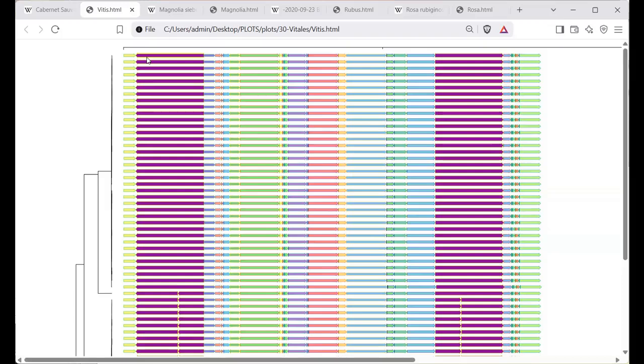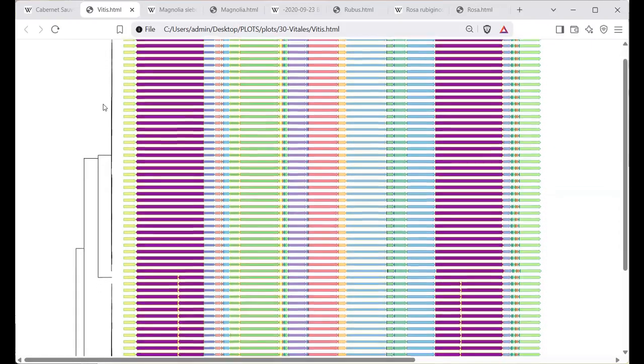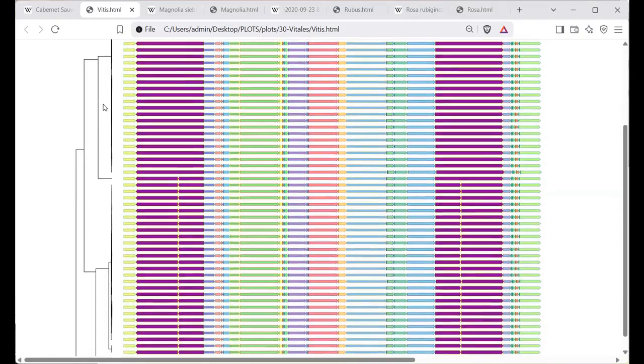And you know that it's an inverted repeat because if you look at the arrow here, it points to the left and this arrow points to the right. The specific direction doesn't mean anything, but when you have arrows pointing in 2 different directions, that means these sequences are reverse complements of each other, as happens with the inverted repeat. So this long region in between the inverted repeats is the long single copy region, and this blue, green, and then yellow is the short single copy region. So you can see that it's quite uniform. All of these sequences have a very similar structure.